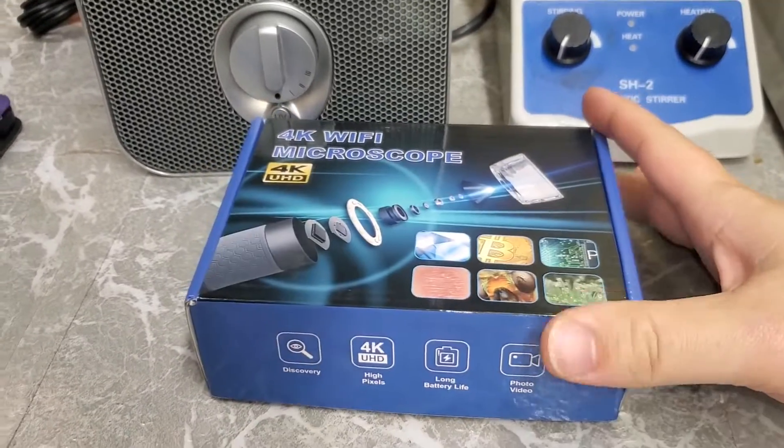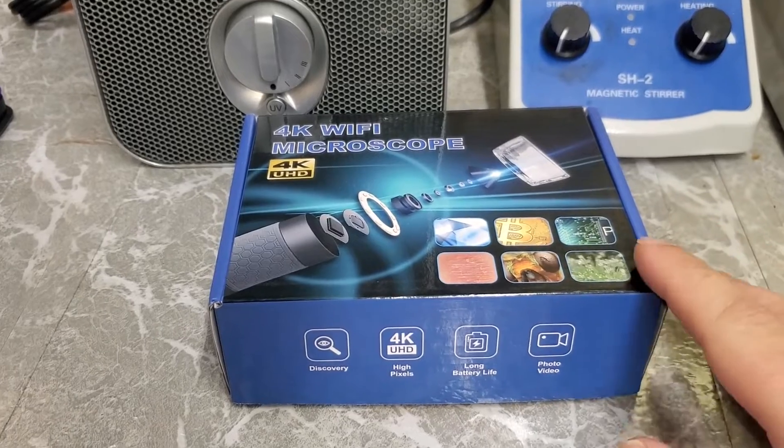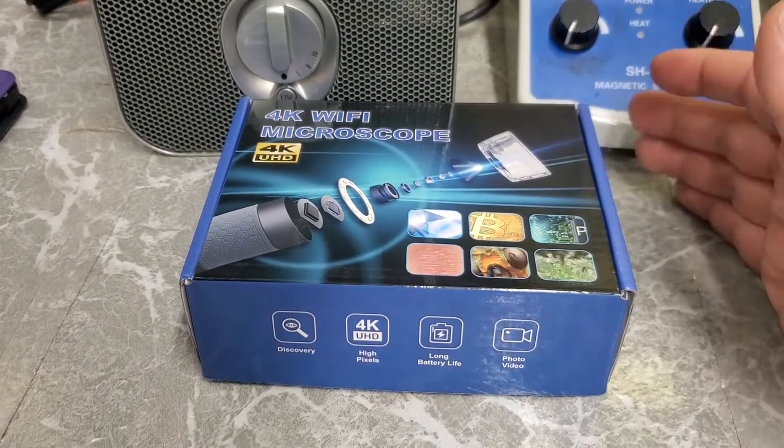How good is a $40 4K Wi-Fi microscope? Please excuse my gunky sounding voice — I just got over a cold, so you'll be able to hear that as I talk more and more. But let's just get into it.